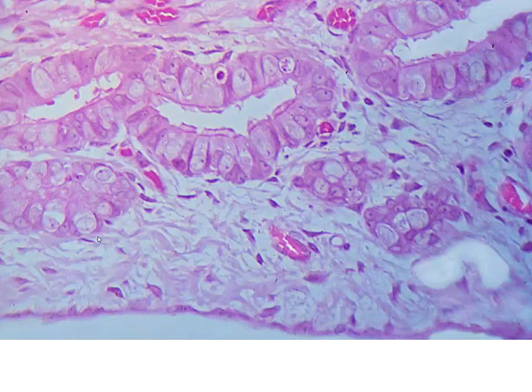Here we can see the epithelium of this folded nature. We can have some ciliated cells, as we see, and then we have non-ciliated cells that are present. These are going to be secretory in nature. We'll see better examples of the peg-type cells, but here we can definitely make out the ciliated versus the non-ciliated cells of the mucosa of the oviduct.